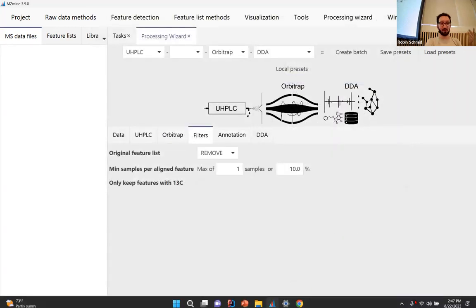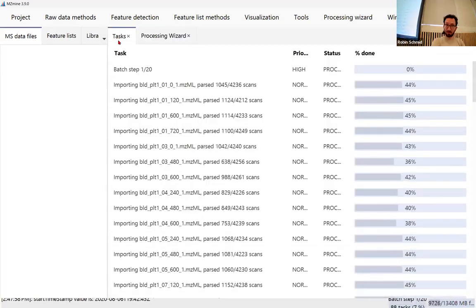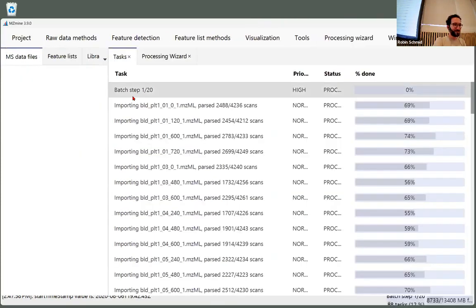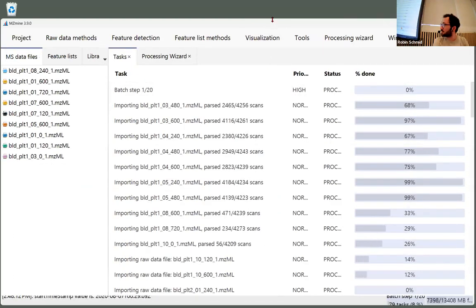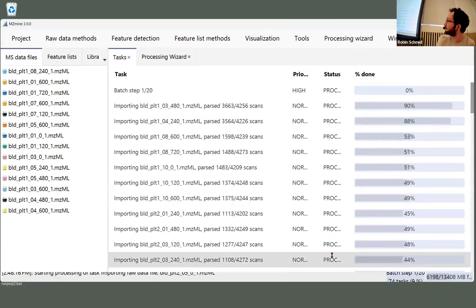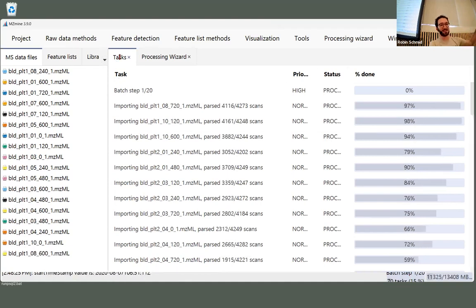And hopefully when I now click on the taskbar at the bottom, so maybe you close the task here on the top. Oh, I zoomed out, right? My screen is the wrong size for the projector, so it's down here. If you click on those, there's a taskbar on the bottom, and it should open the task here.